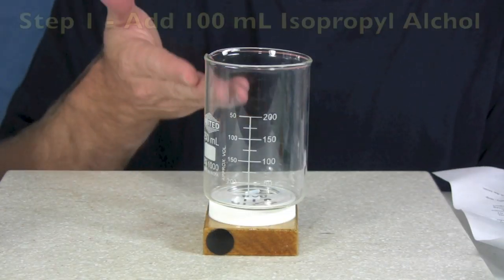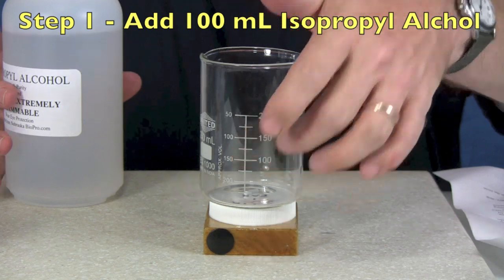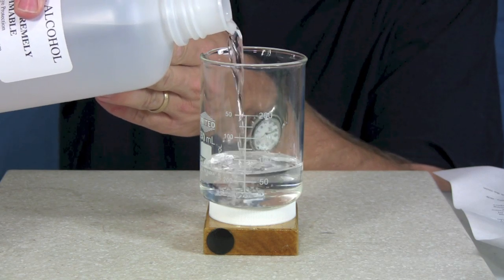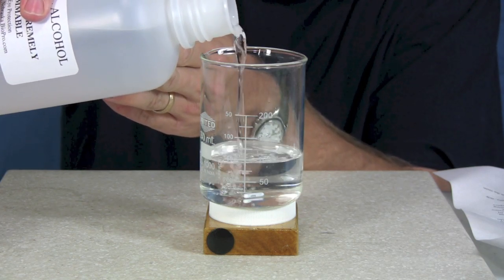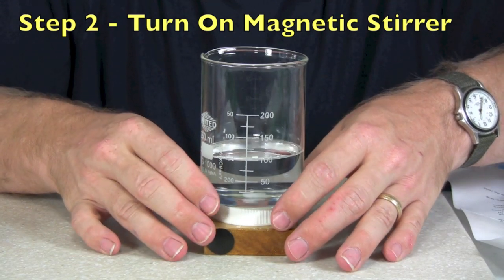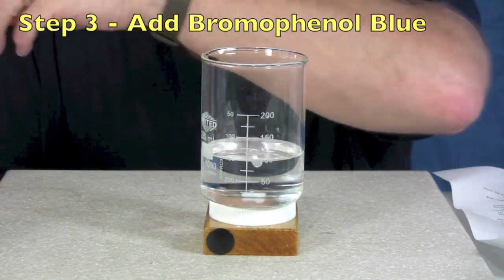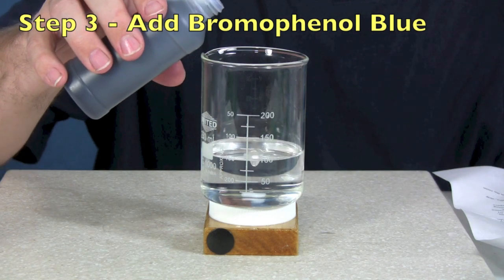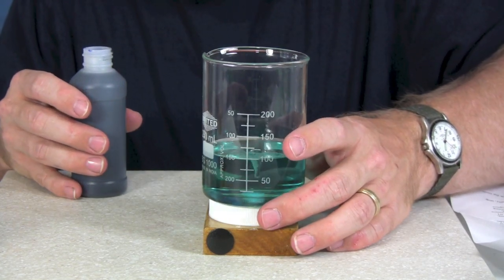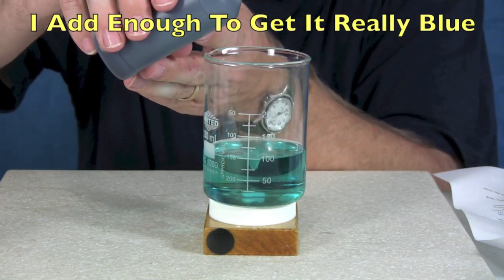The first step is to put 100 milliliters of isopropyl alcohol into the jar. I have a 100 milliliter mark right here, so in we go — we're right at 100 milliliters. At this point I turn on my magnetic stir bar and I start adding in bromophenol blue. If you have a little dropper you can do it that way, but I just put small amounts in here. Notice we're going to go nice and blue — I like to get mine deep blue.